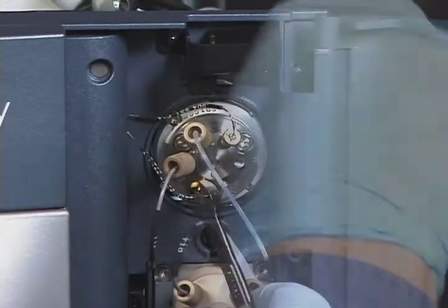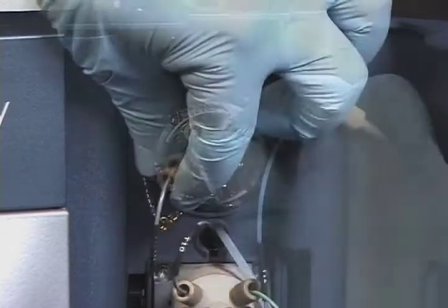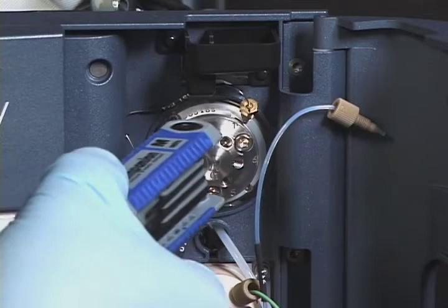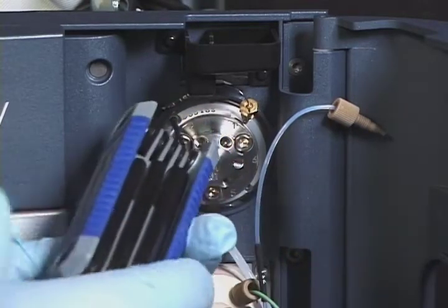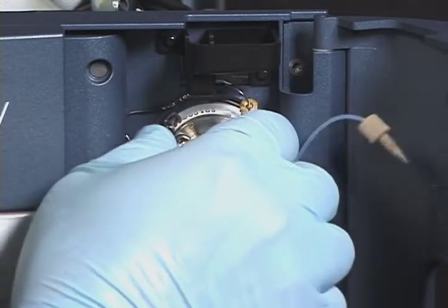Disconnect all of the fittings from the injection valve cartridge. Using the 2mm Allen Wrench, remove the screw at the 10 o'clock position on the inject valve, and then remove the cartridge.